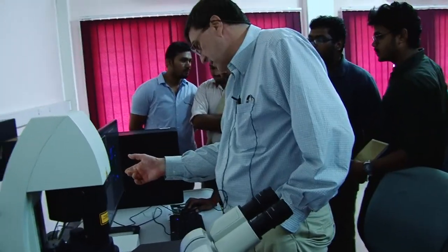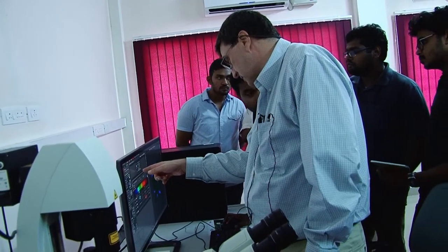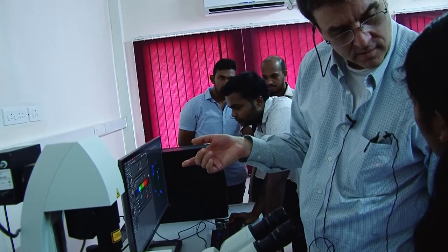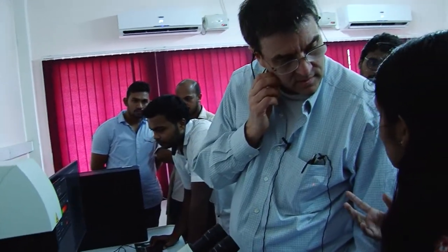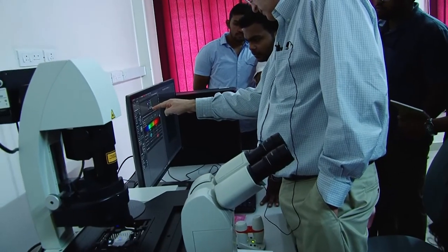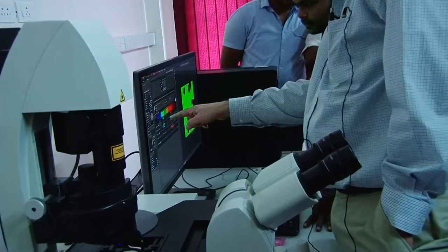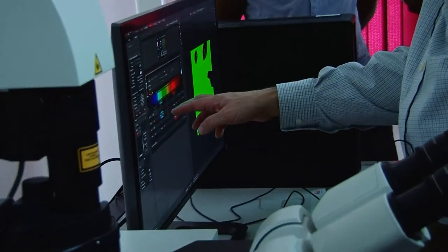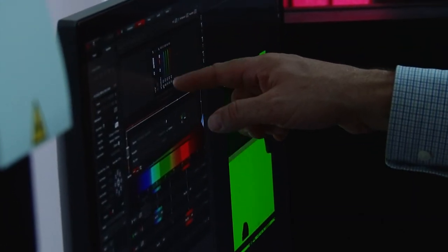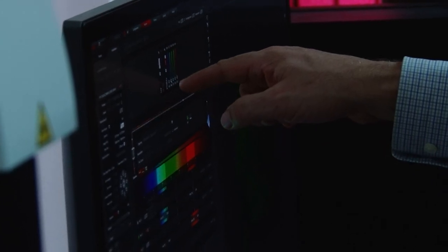Maybe we could try it. Okay, and then let's try, and would you say green is what? The green? FITC. Okay. So turn this up just a little bit to green. Yeah, maybe like 2 or 3%. And then, so we use this, yeah, turn that off, turn the 458. So turn the green up a little bit, the 488.